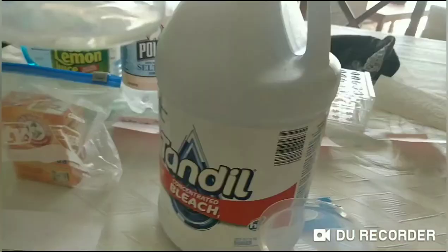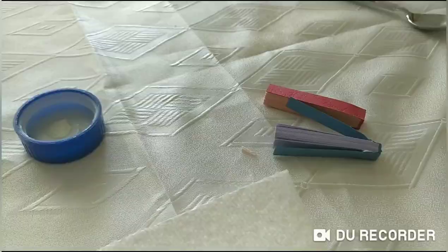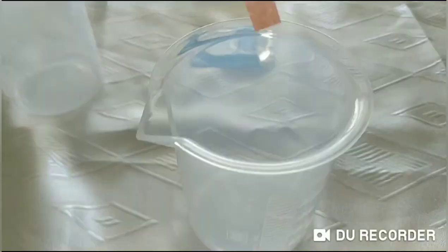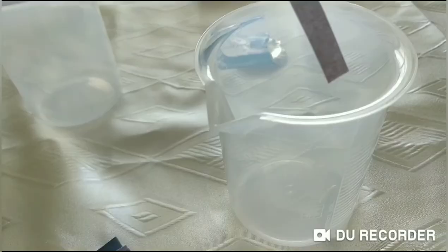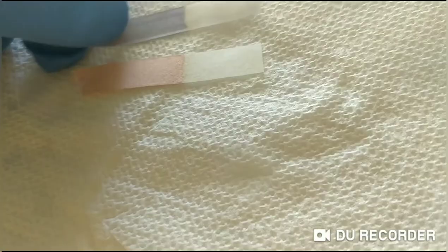I've poured a bit of bleach into the beaker and I'll measure out one milliliter to test with the different litmus strips. Testing with the red litmus paper — it turned completely white. Now the blue litmus paper — again it turned white. After sitting for a bit it's completely white, so once again it turned white.